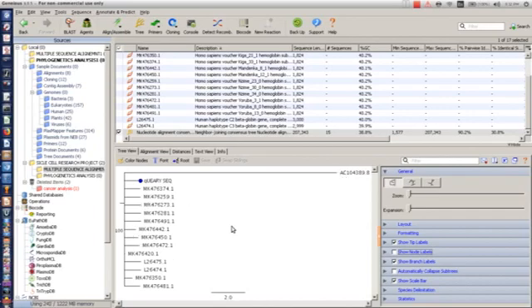But in other cases, we have different kinds of sequences. Maybe we have 60, 70%, 80, 90, in variables. So this graph will be telling you maybe this place is 60 here, 70, and things like that. Once you use this to run an analysis, which is your assignment actually, you will understand what I'm trying to say. So that's that, and if you have questions you can ask.